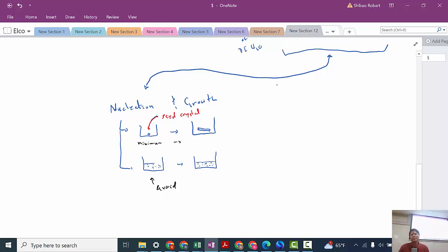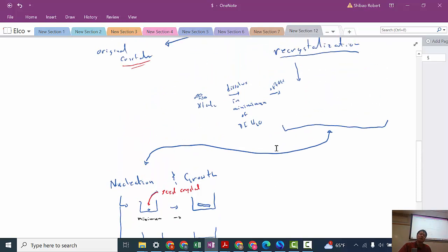So we should have some time. You can take a look at your crystals and assess the situation. If you still don't have crystals, or if your crystals somehow dissolved, then what we need to do is get them to nucleate and grow again. So you'll get some ethanol and try to decrease the solubility to get them to grow again. Hopefully we can get some nice crystals to appear.